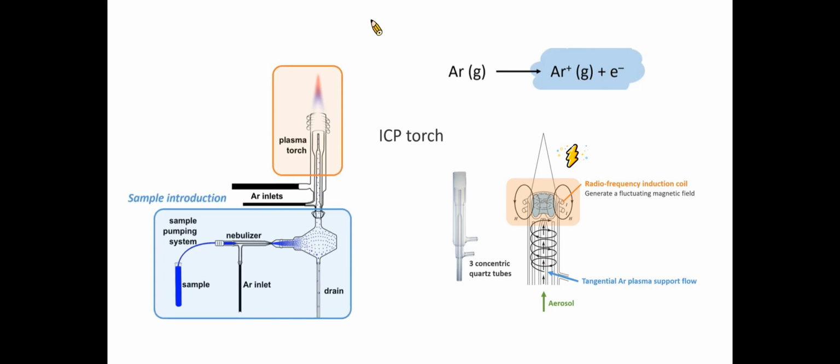Lastly, there are now methods to introduce the atoms generated by ICP into a mass spectrometer. The use of a mass spectrometer may further reduce certain matrix effects. Also, mass spectrometry usually provides more sensitive detection than emission spectroscopy.